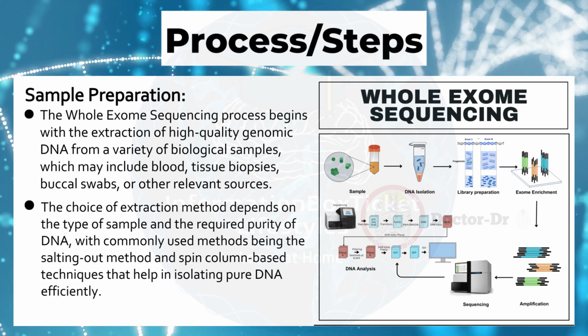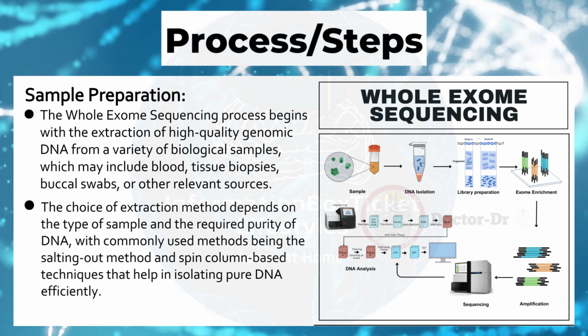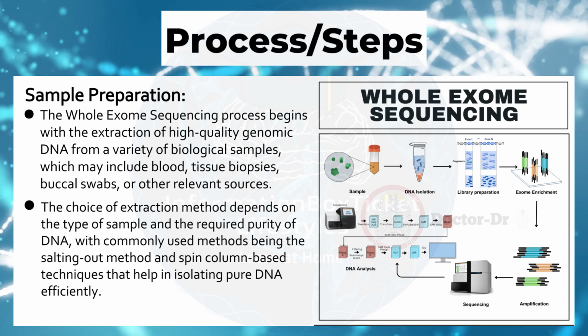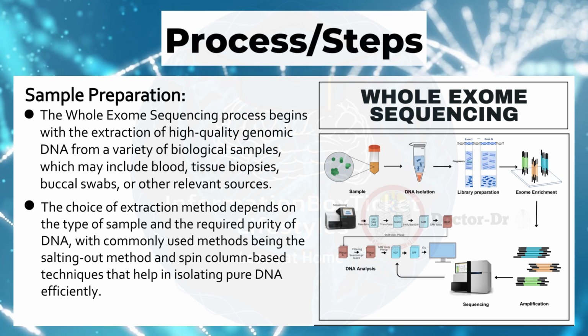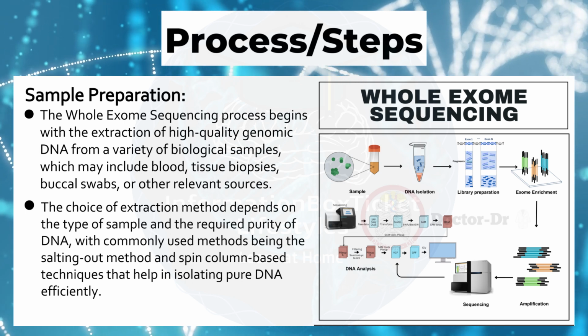The choice of extraction method depends on the type of sample and the required purity of DNA, with commonly used methods being the salting out method and spin column-based techniques that help in isolating pure DNA efficiently.